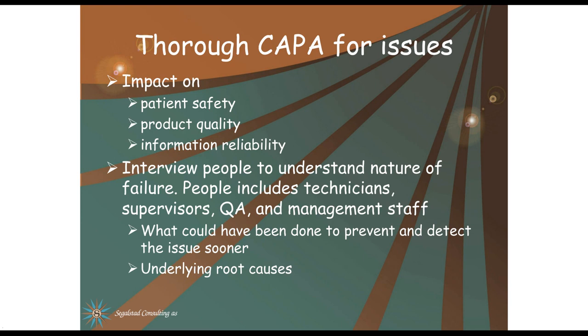Now, what is CAPA? This is another acronym meaning corrective actions and preventive actions. CAPA is included in the GXPs as well as in ISO 9001 and 17025, to mention a few. What it means is that we shall not only correct mistakes, but also assess if anything can be done to prevent them from happening the next time.